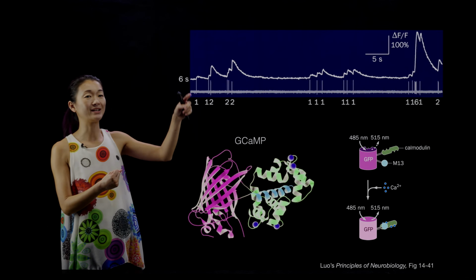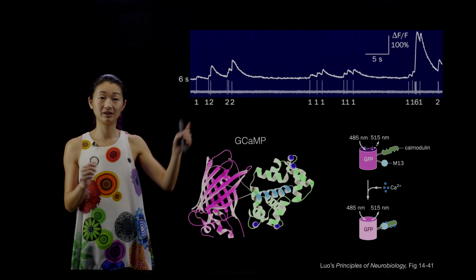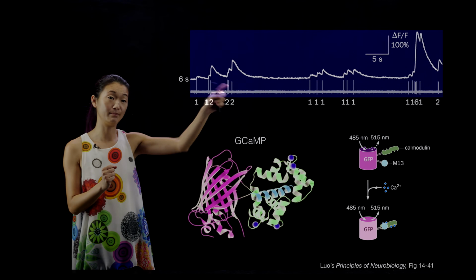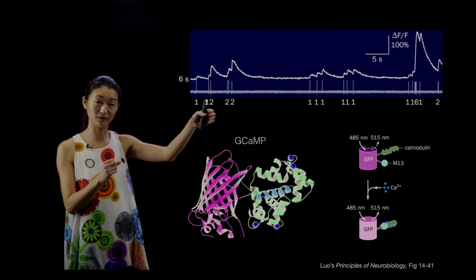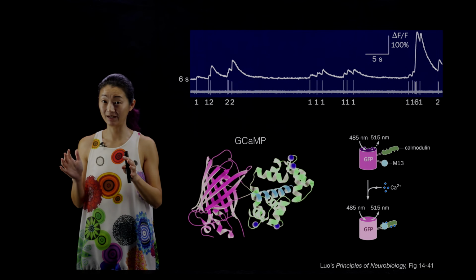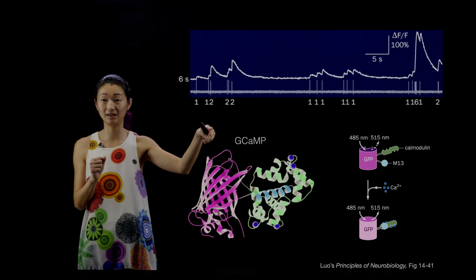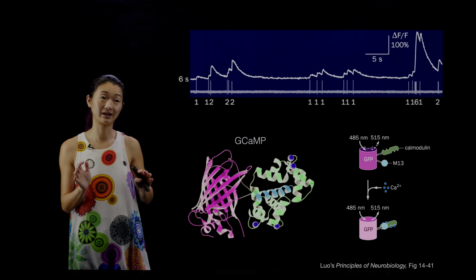So instead of going down as quickly as the electrical potential does, the GCaMP signal goes down exponentially, but much more slowly than the electrical potential. So there's an after effect of the GCaMP because of the GCaMP itself, because the measurement makes it go down more slowly, not because the cell is actually electrically active at that moment. That's a key point, okay?